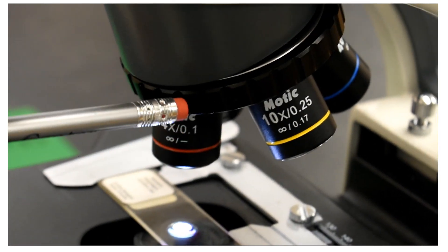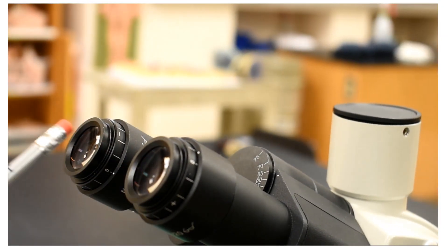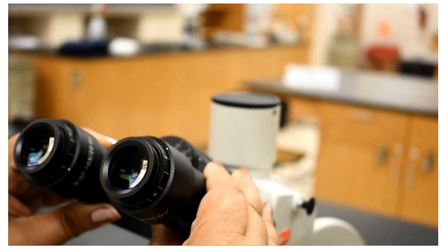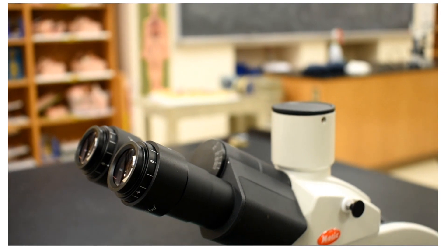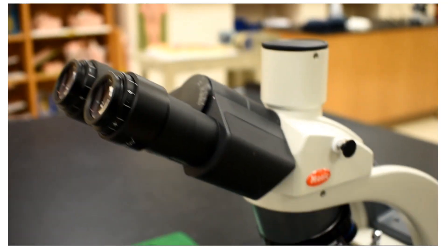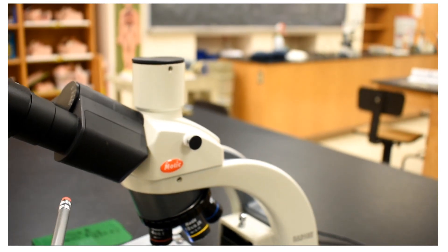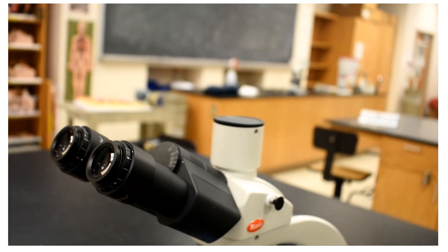Following up from the rotating nosepiece, these are called the eyepieces with ocular lenses. Because the distance between two eyes varies from individual to individual, we can adjust the distance between the two ocular lenses. Each ocular lens has a magnification of 10x total. When looking at an object, once it is focused properly, it will be magnified twice — once by the objective lens in position, and then a second level of magnification by the ocular lens, which is fixed regardless of which objective lens is used. This is why these are called compound microscopes. Since there are two ocular lenses, this is a binocular compound microscope.